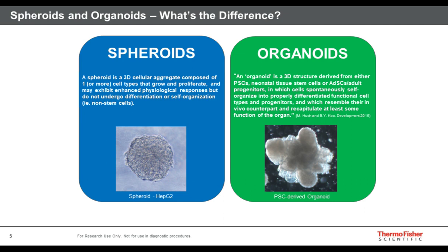However, what you put into this model is all that's ever in there. The cells may grow and proliferate, but there's no differentiation or change of cell types that really happens. So in other words, there's really no stem cell compartment to these models.